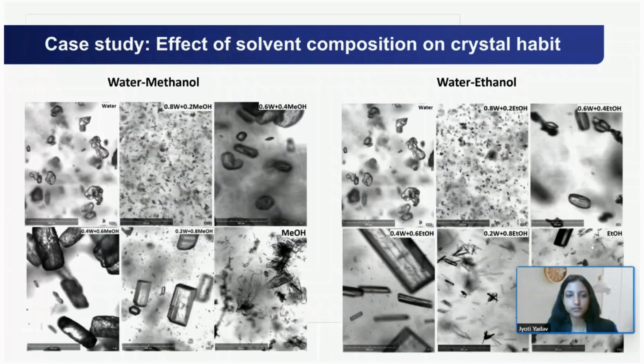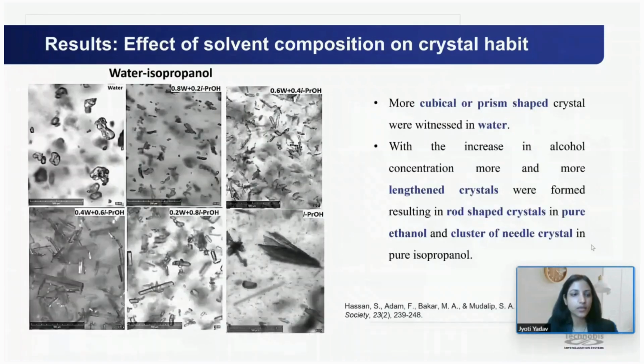So next, similarly, in the water-isopropanol solvent system, more elongated crystals were formed, and in pure isopropanol, clusters of needle-shaped crystals were formed. These images were captured using the Crystalline cameras.